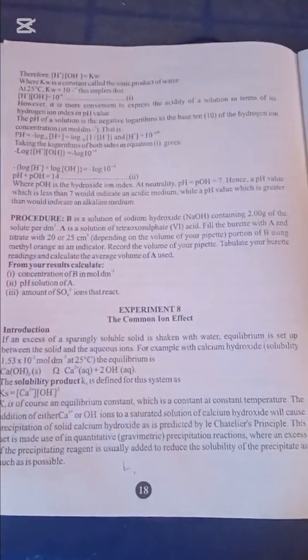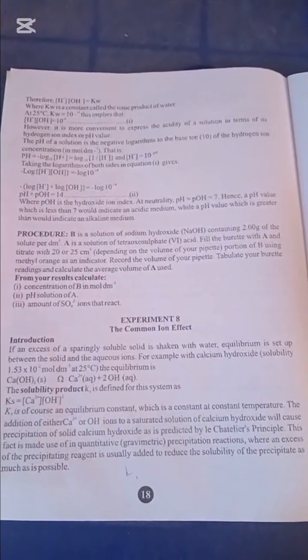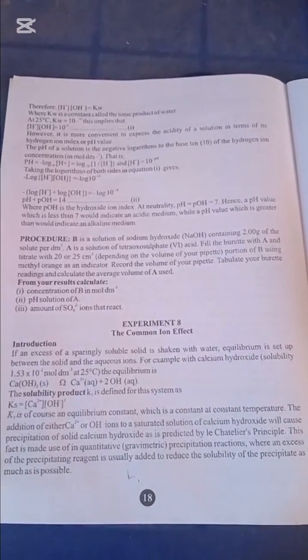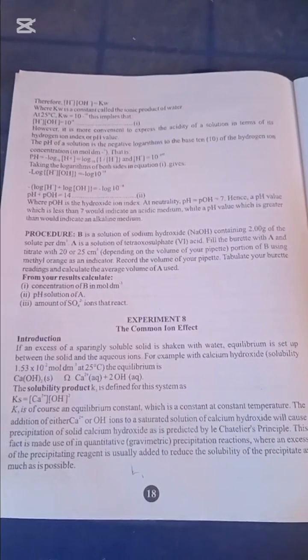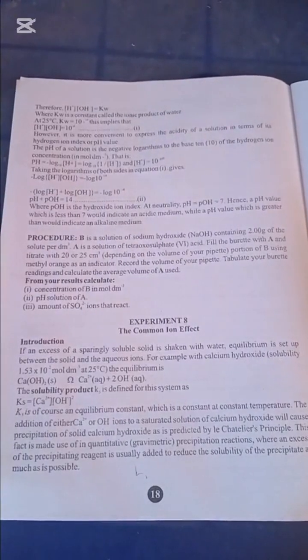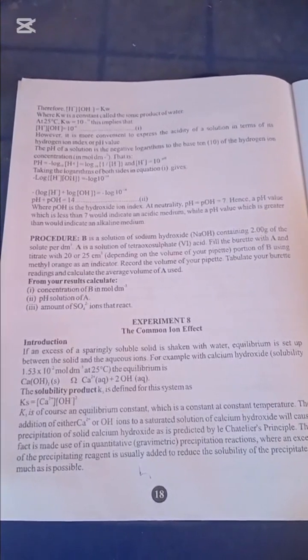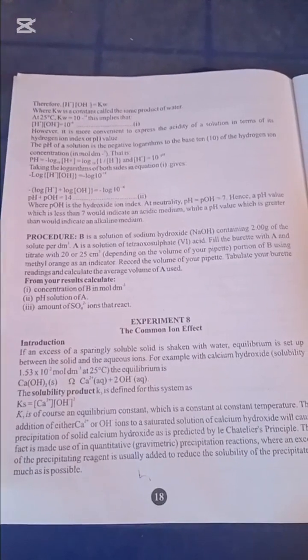We'll be doing procedure B, which reads: B is a solution of sodium hydroxide containing 2 grams of the solute per dm cube. A is a solution of tetraoxosulfate VI acid. Fill a burette with A and titrate 20 or 25 cm cube, depending on the volume of your pipette, portion of B using methyl orange as an indicator. Record the volume of your pipette, tabulate your burette readings, and calculate the average volume of A used.